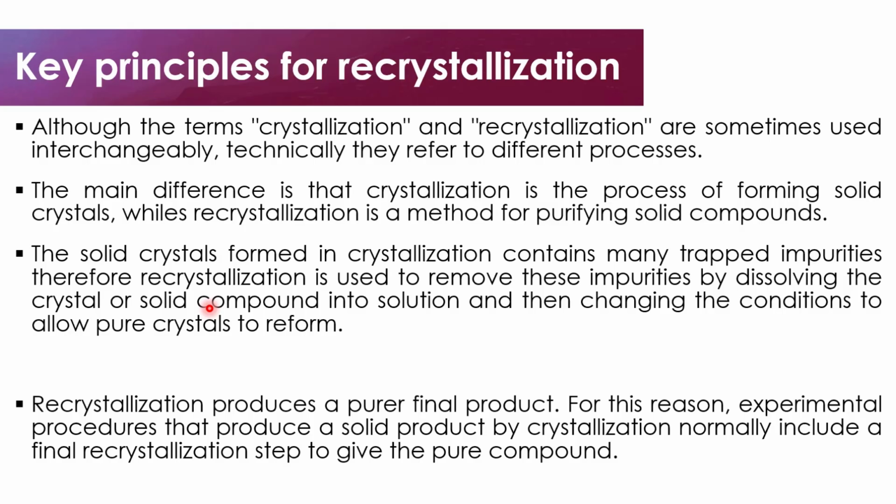Although the terms crystallization and recrystallization are sometimes used interchangeably, technically they refer to different processes. The main difference is that crystallization is the process of forming solid crystals, whilst recrystallization is a method for purifying solid compounds. The solid crystals formed in crystallization contain trapped impurities.